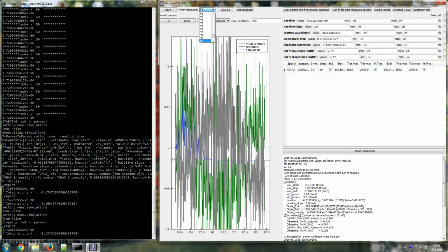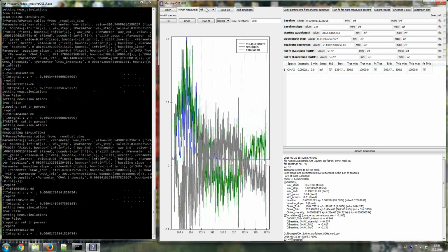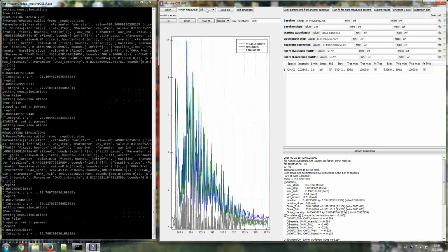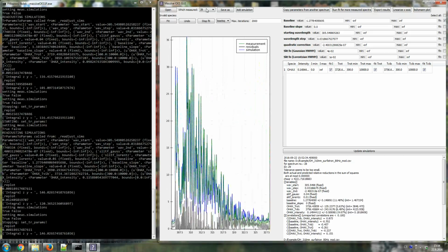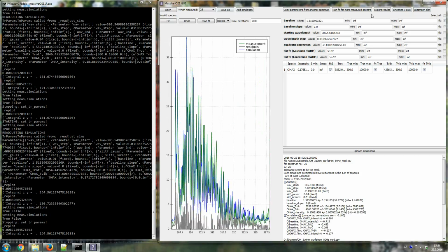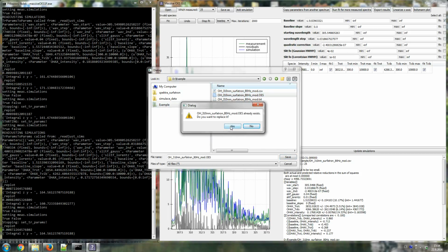So basically the last spectra looked really bad, but if we go up, it's better and better, so we can have the image of what we can trust. Yeah, and it looks like this. So now we have all the fitting done. We can save our project again so that we don't lose that. So we have already made the file, so we just overwrite that.